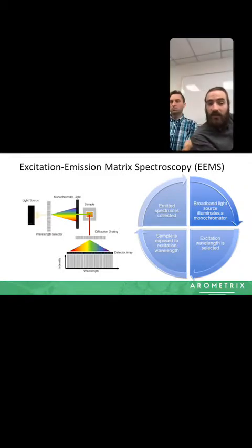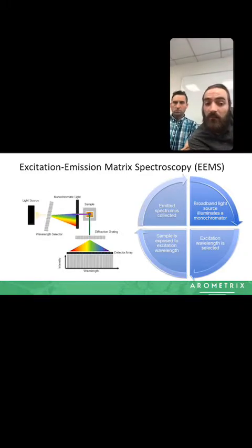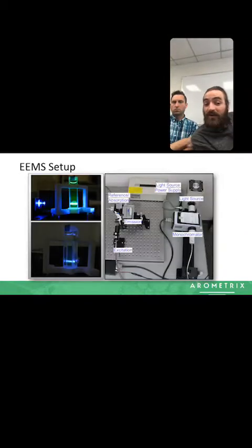If you notice on this slide, the light that we're letting go to the sample right here is yellow, but when you want to change your light, you can change your diffraction grating a little bit, and you only allow purple light, for instance, in this case, to go through. So in this way, you can scan through all excitation lights, as well as receive all absorption and emission spectra at the same time. So this is a great type of system.